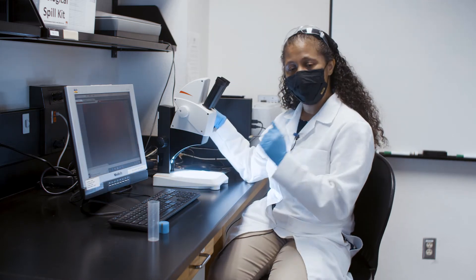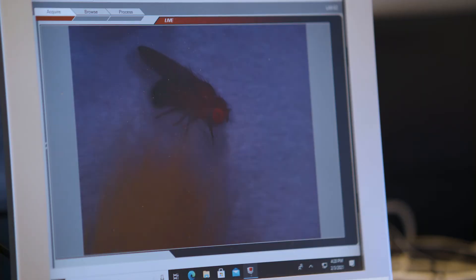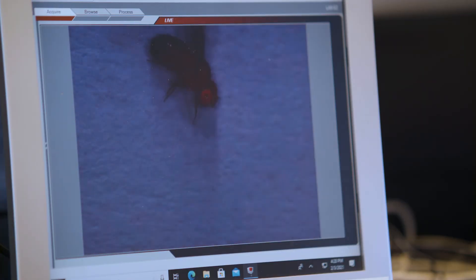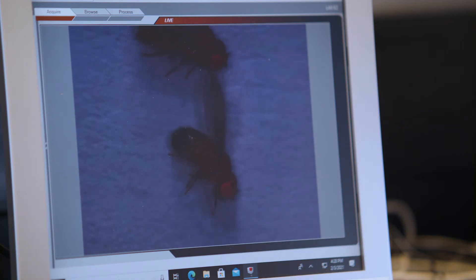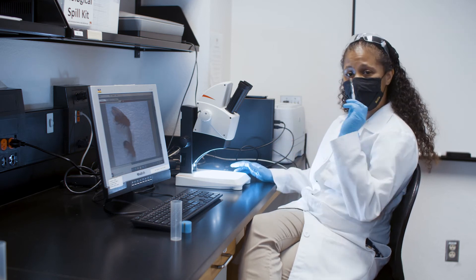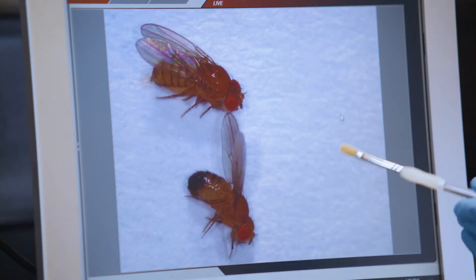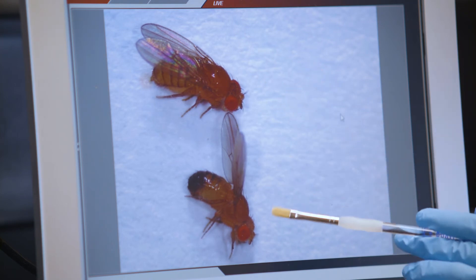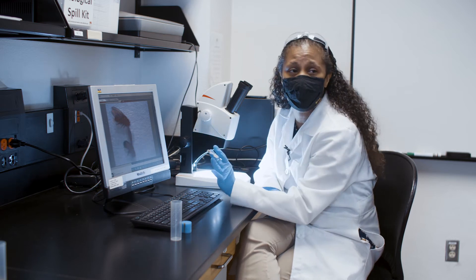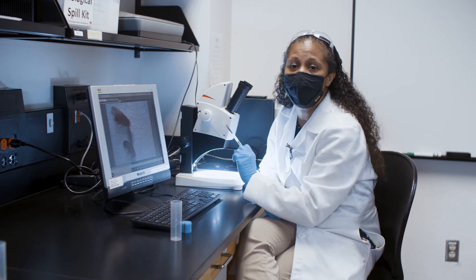I've found a male and a female and lined them up side by side using the paintbrush so I can show you some of the differences between the two. The first thing to point out is that females tend to be much larger than males. Do not use this as your sole identification criteria because there are a bunch of different factors that can influence fly size, but that's the general rule of thumb.